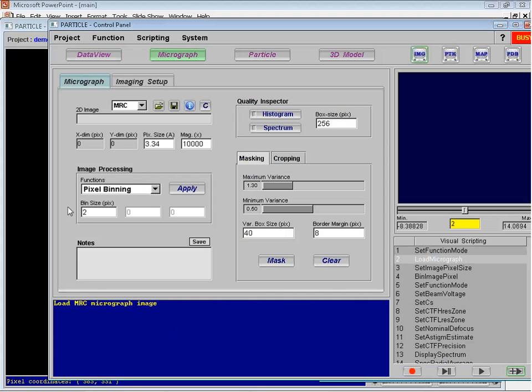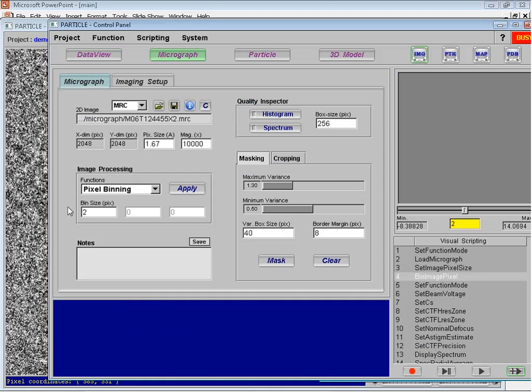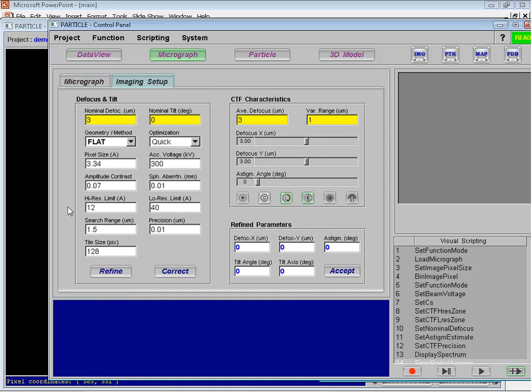Okay. So now it's running on these 4 images, and on a fast computer, it will take just less than 1 minute, but it might take a couple minutes for this notebook. As it's running, I'm going to introduce the next demonstration, which is for serial image registration.